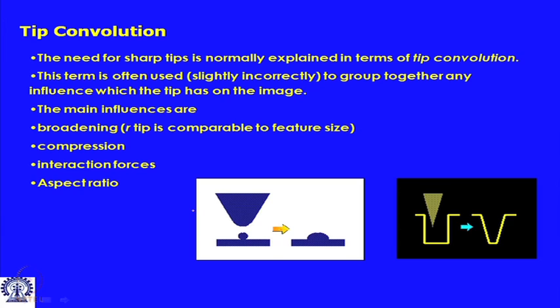It is not a true image, that is, you get x, y versus z data, which is then transferred to sort of an image, so that it can be understandable to the user. One major thing is that the resolution of the image, to a large extent, as we have been repeatedly telling, is a function of the tip size, because you can understand that if you have a feature like this and your tip is wide like this, what you will see is a large feature like this.